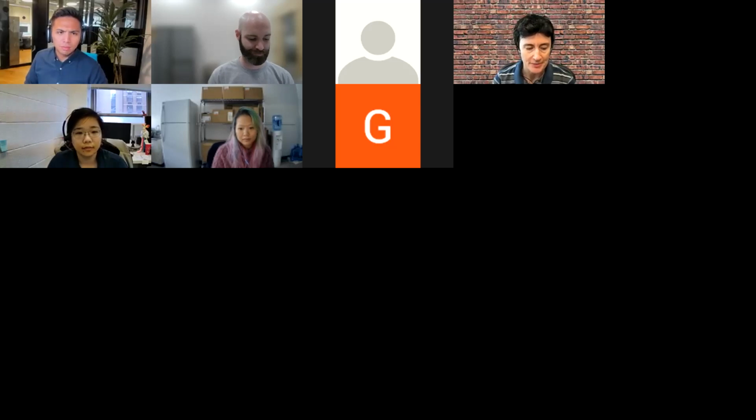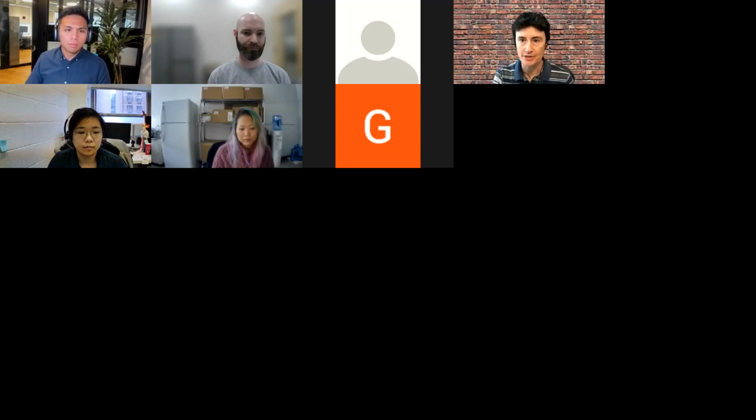There is a cost to it, but the Edinburgh folks just came up with an idea to help with that. I mentioned it briefly on my last slide as a possible area of work for the future. They have this idea for the respective groups to pre-compute lineage assignments and make those available as part of pangoLEARN, so that if it recognizes a sequence that has a pre-computed assignment, it will just call that instead of calling pangoLEARN or calling UShER.